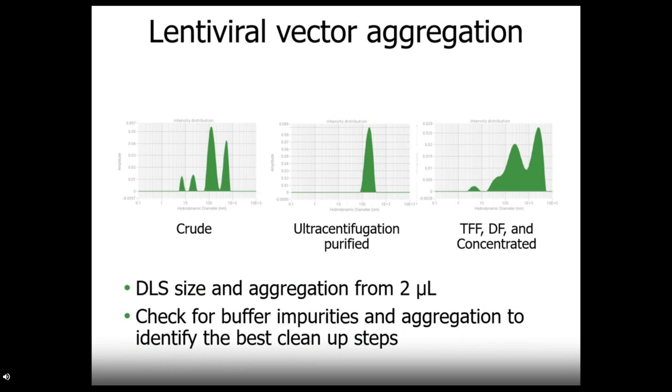Now, while we have specific applications for RNA-LNPs and adeno-associated viruses, Stunner will help you with other drug delivery systems as well. Here, we can see measurements of a lentiviral vector at different steps in the process. The crude sample has some small impurities and large impurities or aggregation. Choosing ultracentrifugation as next step shows a nice and monodispersed lentiviral vector. Now, when the same crude sample goes through tangential flow filtration, diafiltration, and concentration steps, a lot more impurities and big aggregates are showing up for this specific sample. Stunner gives you size and aggregation so you can check any step of your flow for buffer impurities and aggregation to identify the best formulations and cleanup steps.